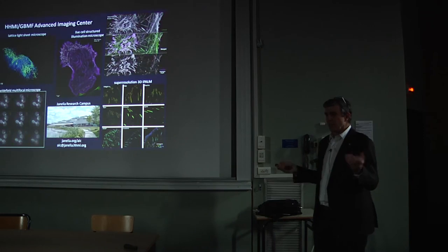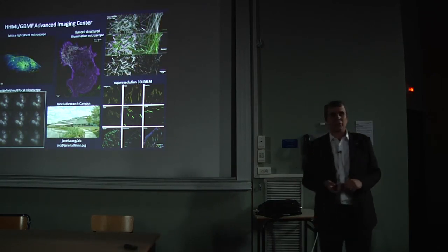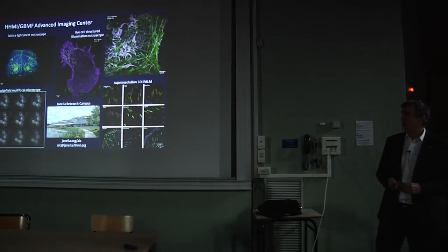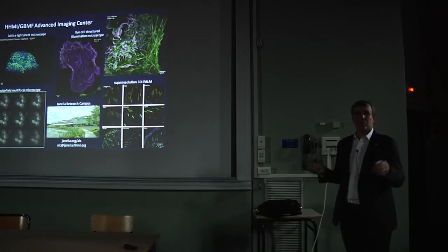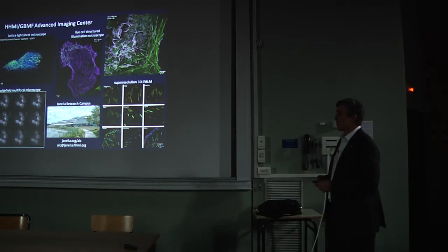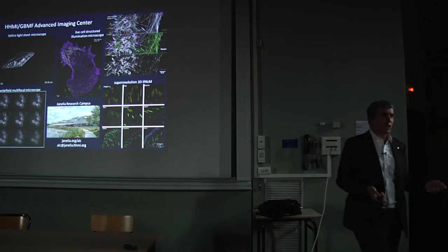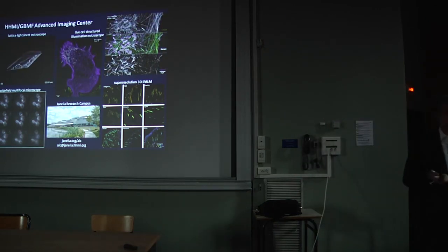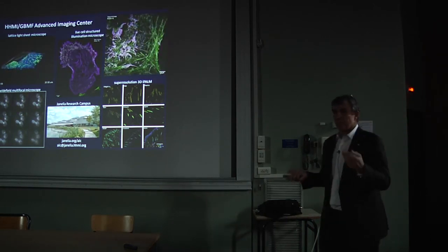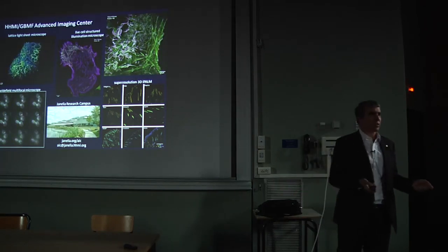And the lattice light sheet, you can now buy clones of what we have from a small company that has a sub-license called 3i. And the primary licensee, Zeiss, is working on a turnkey instrument that they hope to bring out to market in a couple of years. And it's not that I give a crap about any of the money or anything like that, but I've been in business myself long enough to understand that the kind of instrument a physicist can make is not the kind of instrument a biologist wants to use.